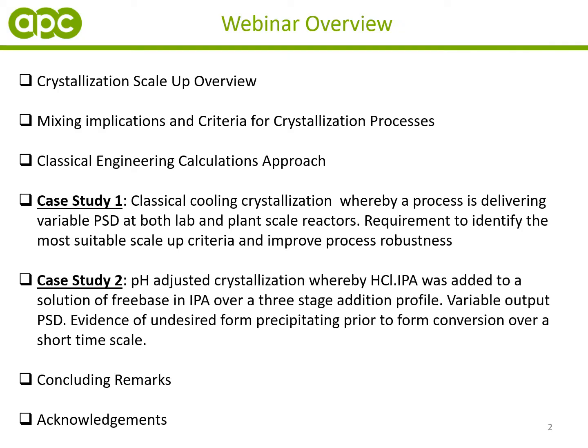So just a brief overview of the webinar. I'm going to touch on an overview of crystallization scale-up, some of the mixing implications and criteria for crystallization processes, some of the engineering calculations and how they're used to design an effective scale-up solution. And then I'm going to touch on two case studies.